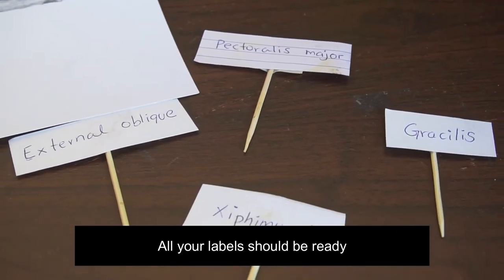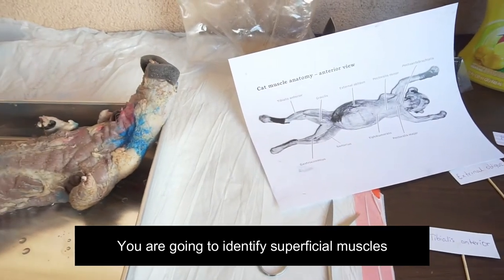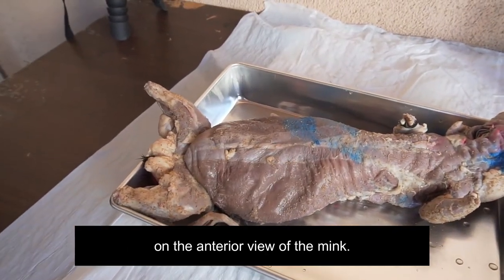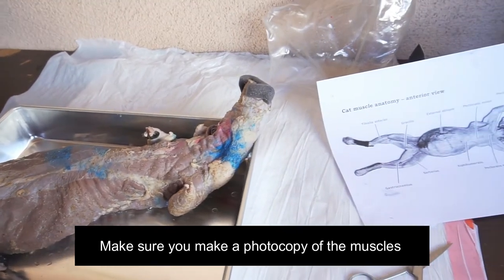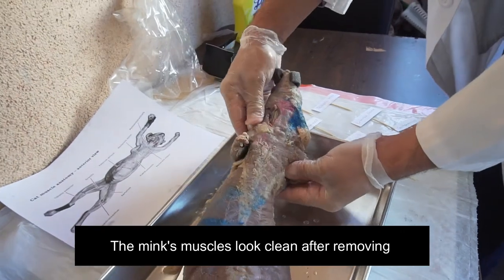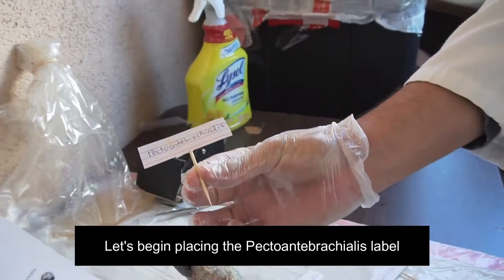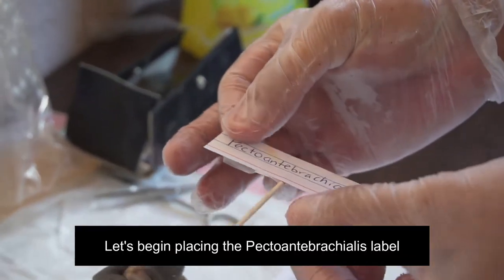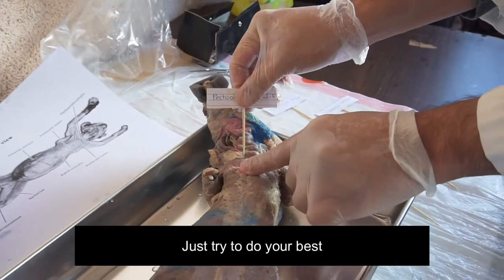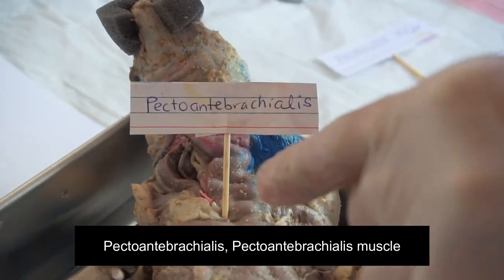All your labels should be ready to place them on the right muscle. You are going to identify superficial muscles on the anterior view of the mink. Make sure you have a photocopy of the muscles you are going to identify. The mink's muscles look clean after removing adipose and connective tissue. Let's begin placing the pecto-anti-brachialis label on the correct muscle. Just try to do your best.